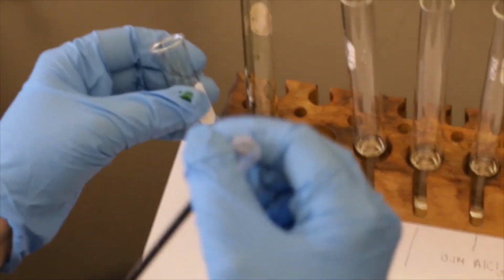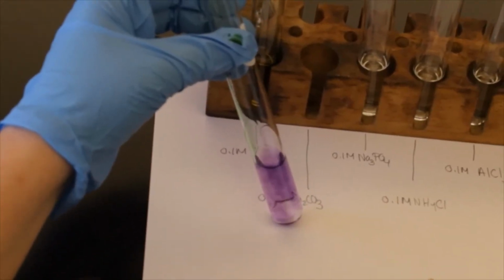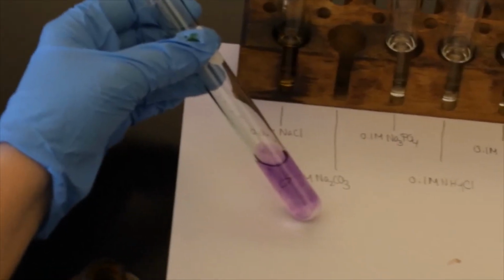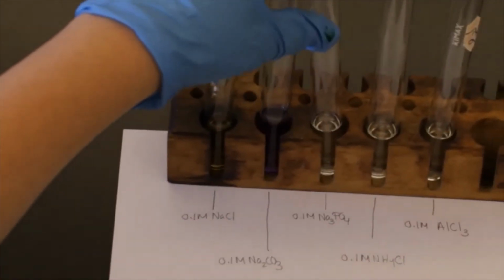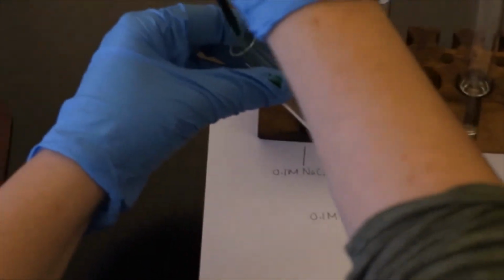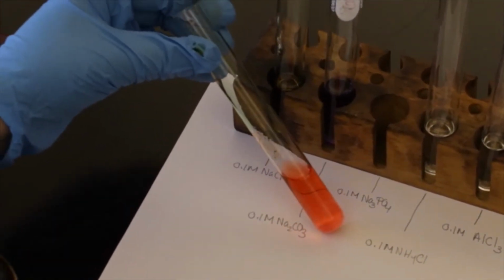If we're now looking at Na2CO3, we'll add a few drops in. Look at that, a nice purple color. Okay. So you have a purple, almost like a lavender, a little lilac. If we're looking at Na3PO4, we're going to add our couple drops in. Take a second to mix in. And we have red. This orange-red color. There it is.